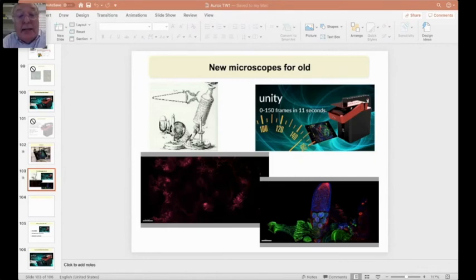It didn't catch on in the way in which the acoustic microscope didn't catch on. I mean, really, all the optical microscope can do is measure refractive index. Well, frankly, who cares? The acoustic microscope, on the other hand, does measure serious material properties.